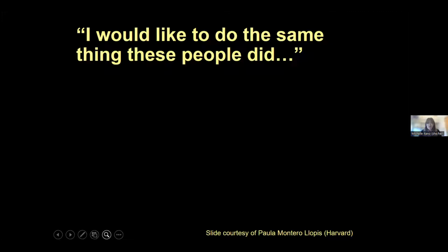So often what happens is we don't actually get to this point, right? One possibility is that you do publish and everything went very smoothly. You followed your data, you published, and it all went very smooth. The other possibility is you get to the microscope and you go, that's not the cell I thought I was going to see, right? Or that's not what I saw those other people do, right? And so we get many people asking us as imaging scientists, how do I do what these people did?